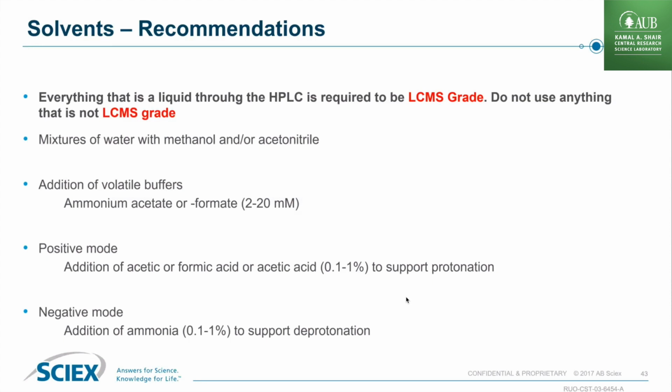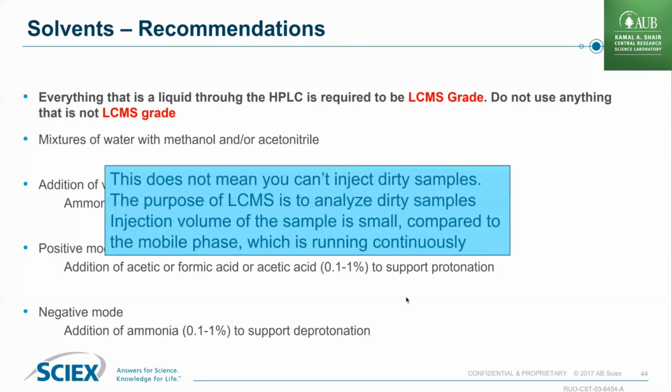Now, I get a lot of questions about the samples, so I put this in. This is actually a new slide for today. This doesn't mean that you can't inject dirty samples. What we are talking about here are the running solvents, the mobile phase that is continuously pumped through the LC and continuously fed into the ion source. That needs to be as clean as it possibly can.